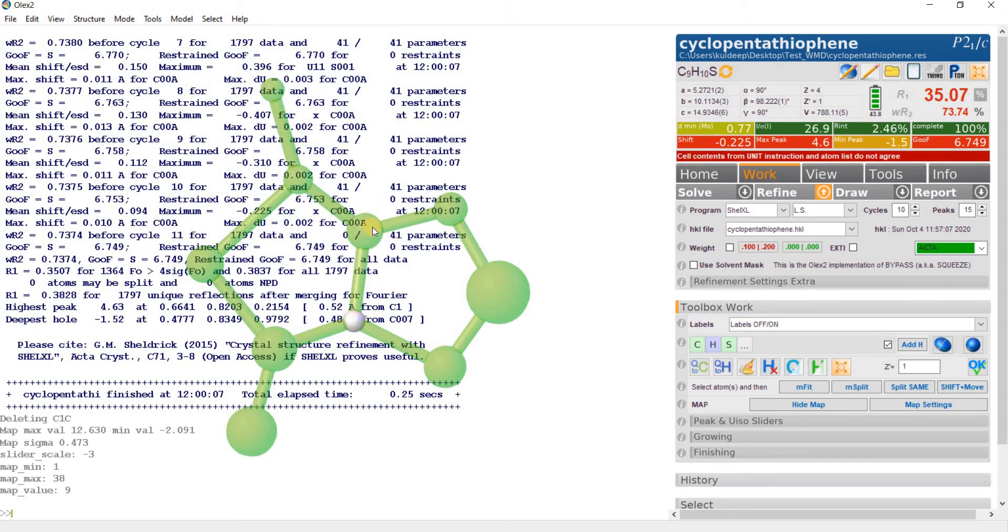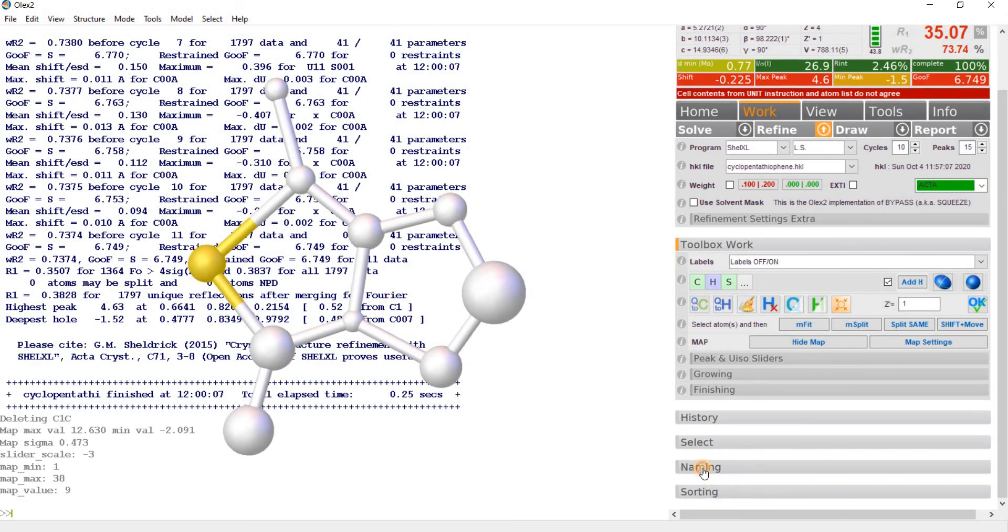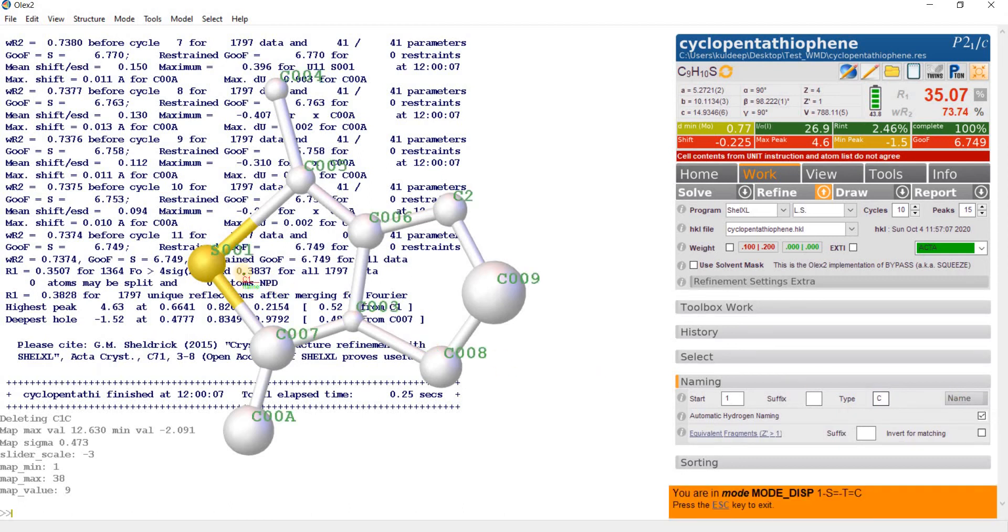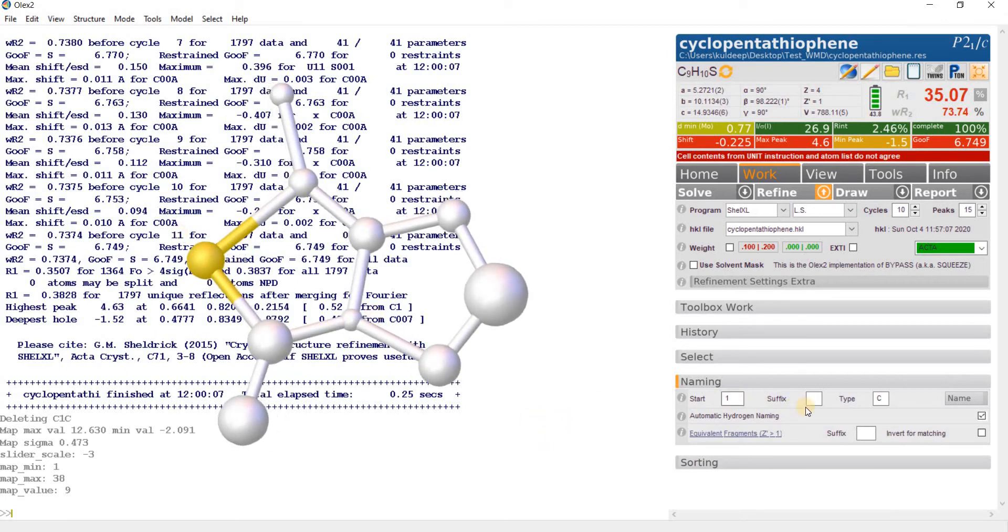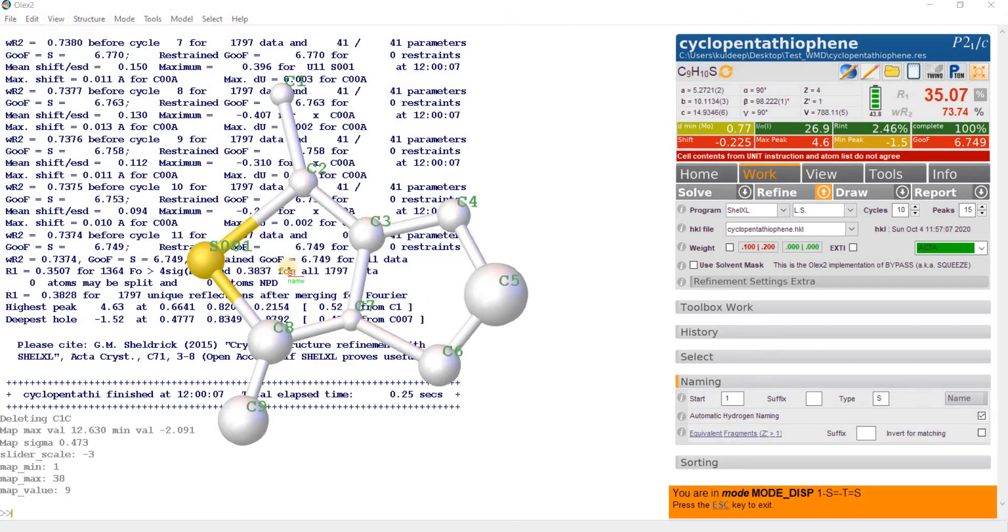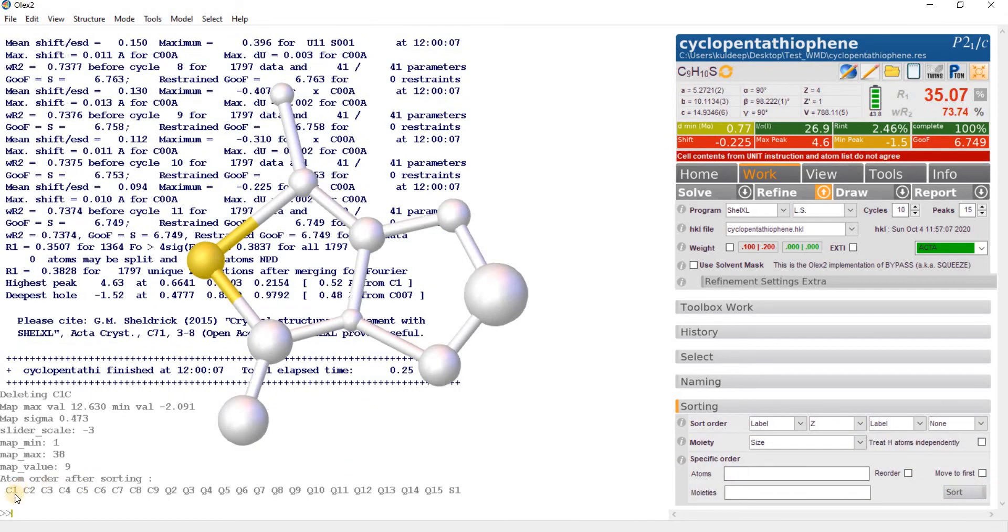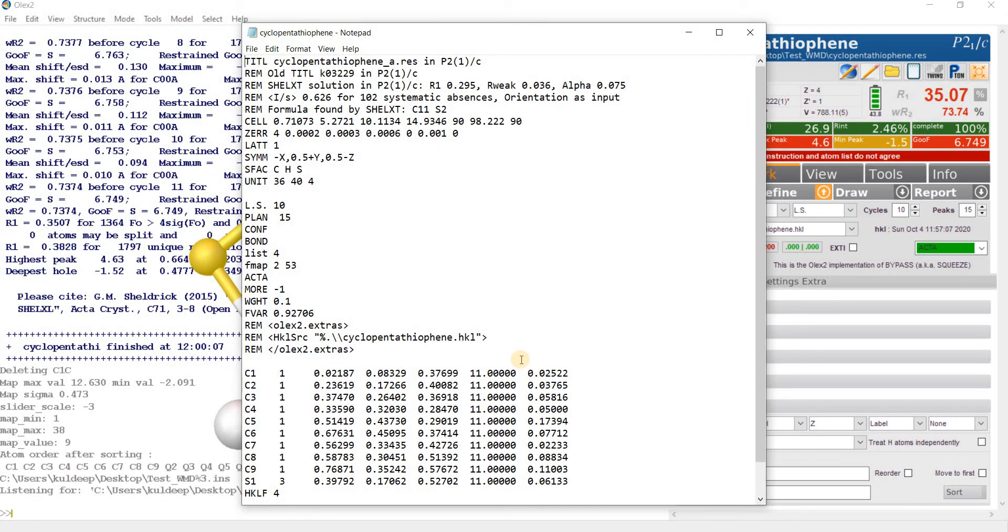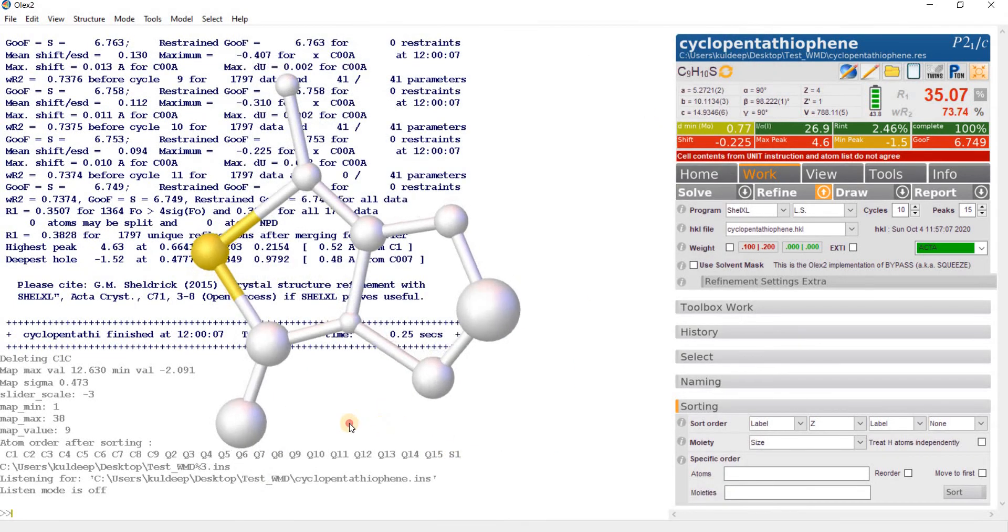Before modeling disorder, let's do a systematic naming. Go to naming and start from 1. Type carbon and name the atoms: C1, C2, C3, C4, C5, C6, C7, C8, and C9. Then escape. Type sulfur, name it S1, escape. Now sort these atoms by pressing sort. We are getting C1, C2, C3. You can edit the INS file to see the ordered atoms.